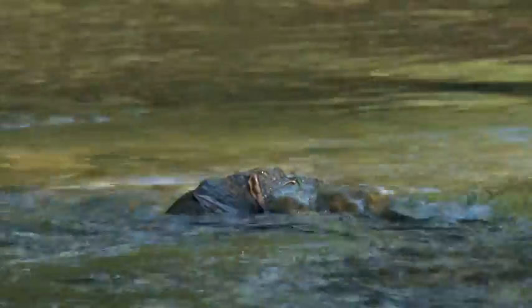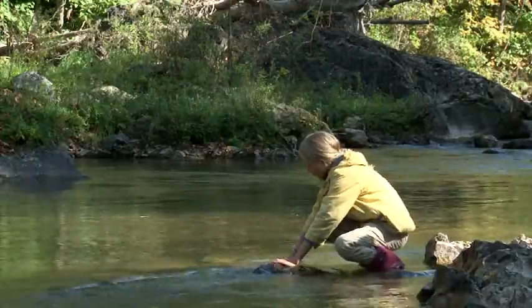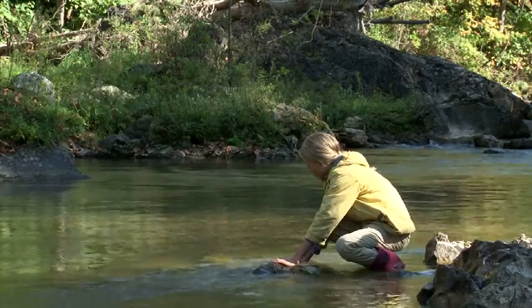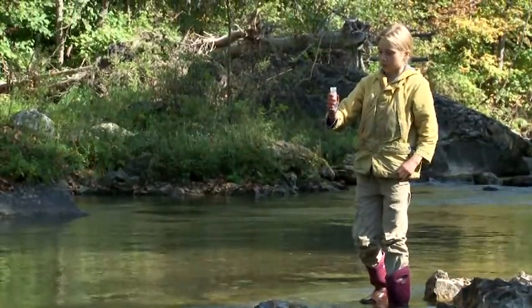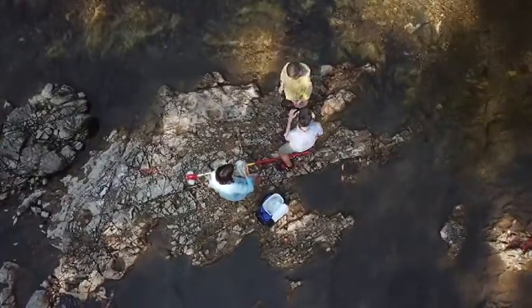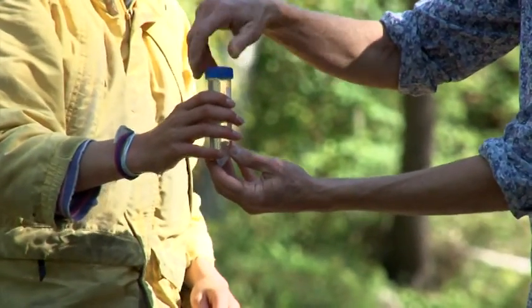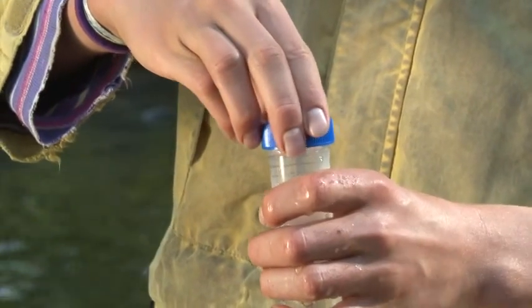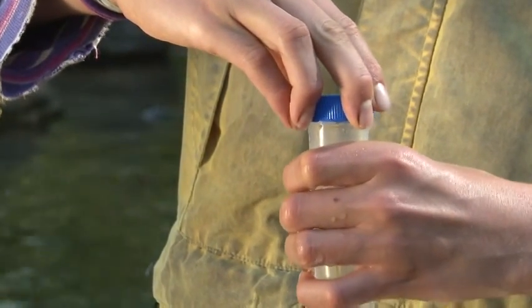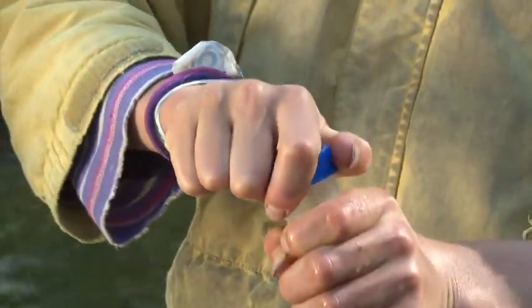Bjorn is triple rinsing the bottle, plunging into the water column, tipping to let the air out before removing from the water column. Here we want to fill to the line marked on the outside of the vial. And it's important with these nitrogen bottles to not cross-thread the cap. And you can do so by lefty-loosey, turning counterclockwise at first and then clockwise to seat the threads properly.